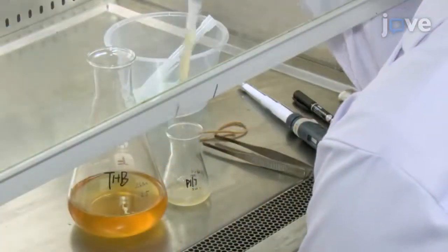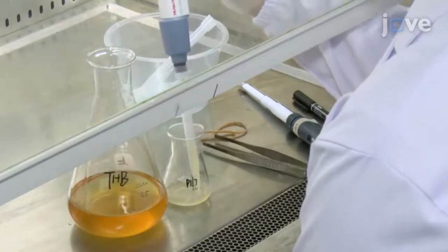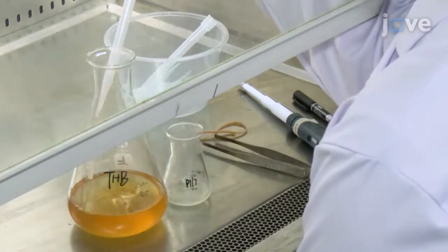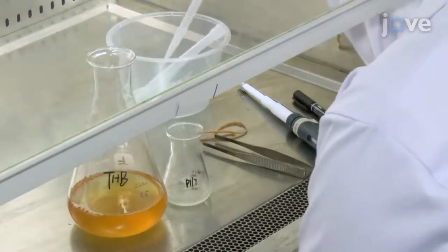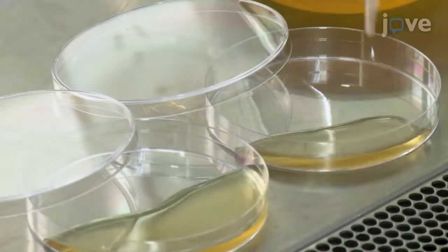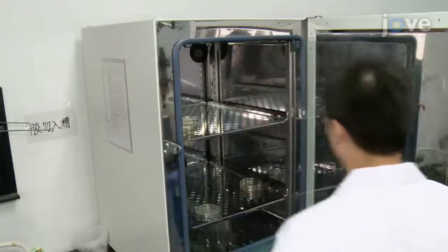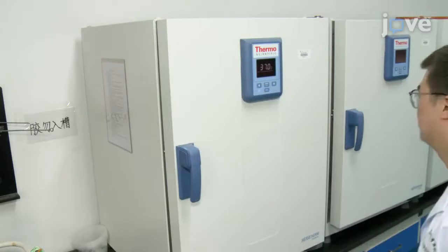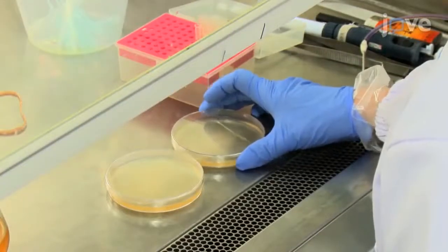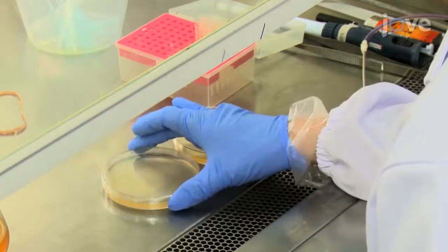Alternatively, to collect strain P17 biofilm state cells, take 20 mL of an overnight culture and add 180 mL of fresh THB. Equally divide the diluted culture into 10 brown culture plates. Then incubate the plates at 37 degrees Celsius in 5% carbon dioxide for 24 hours. Following incubation, shake the plate gently to resuspend the bacteria that have not adhered to the plate, and avoid resuspending the sediment.